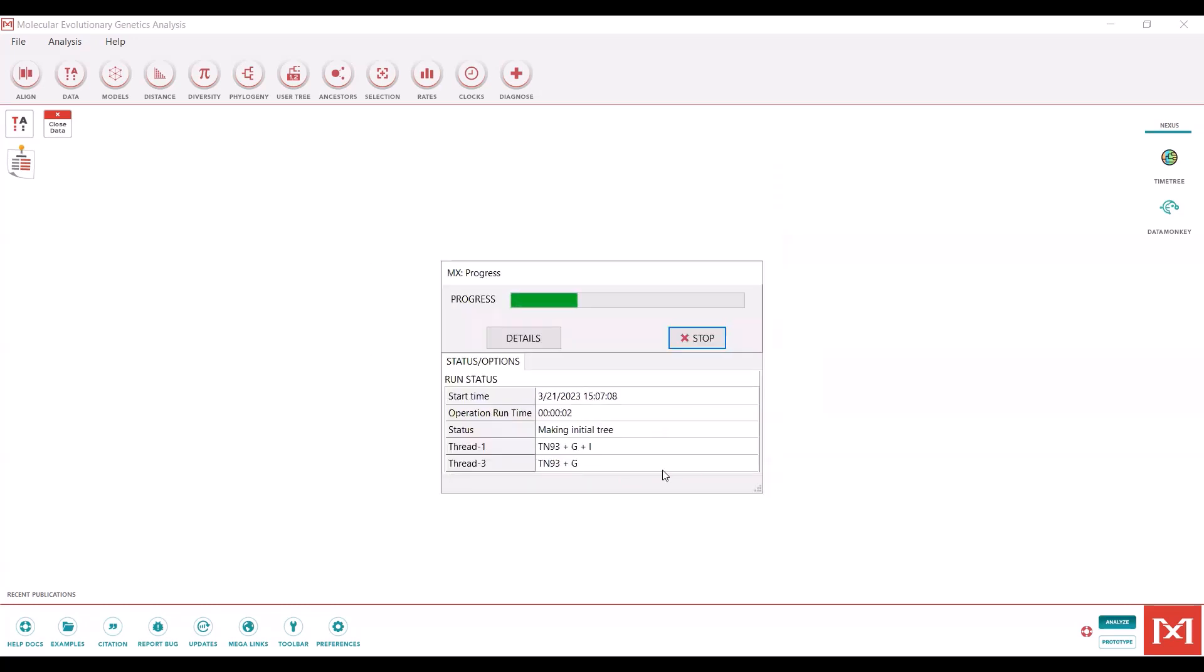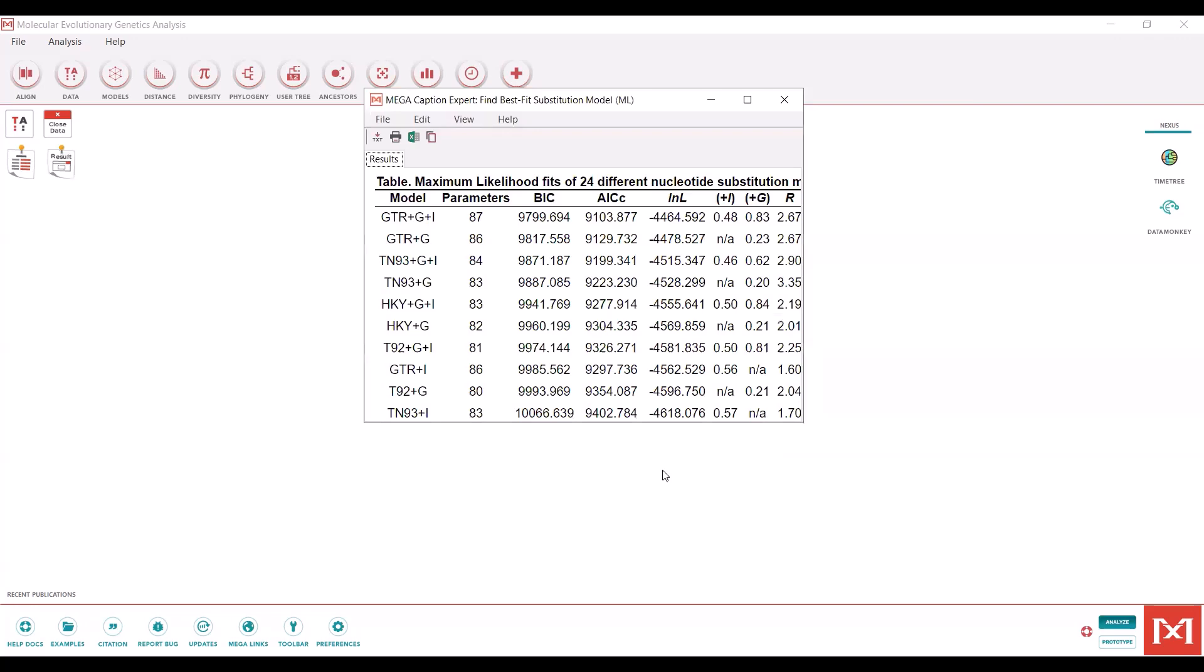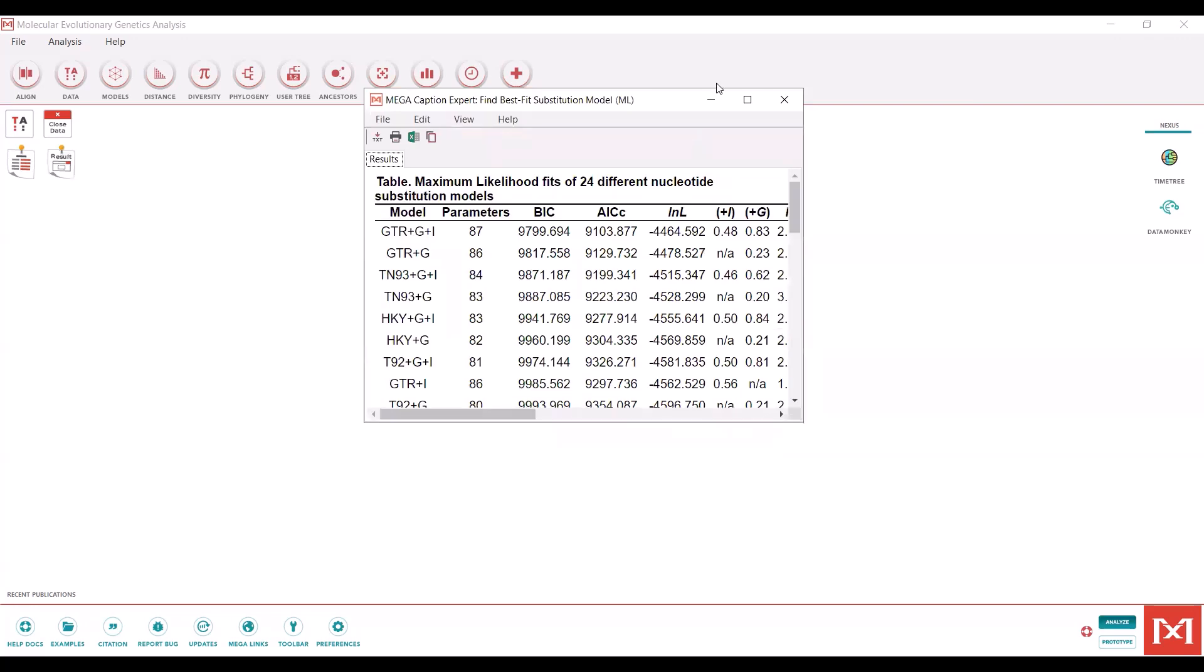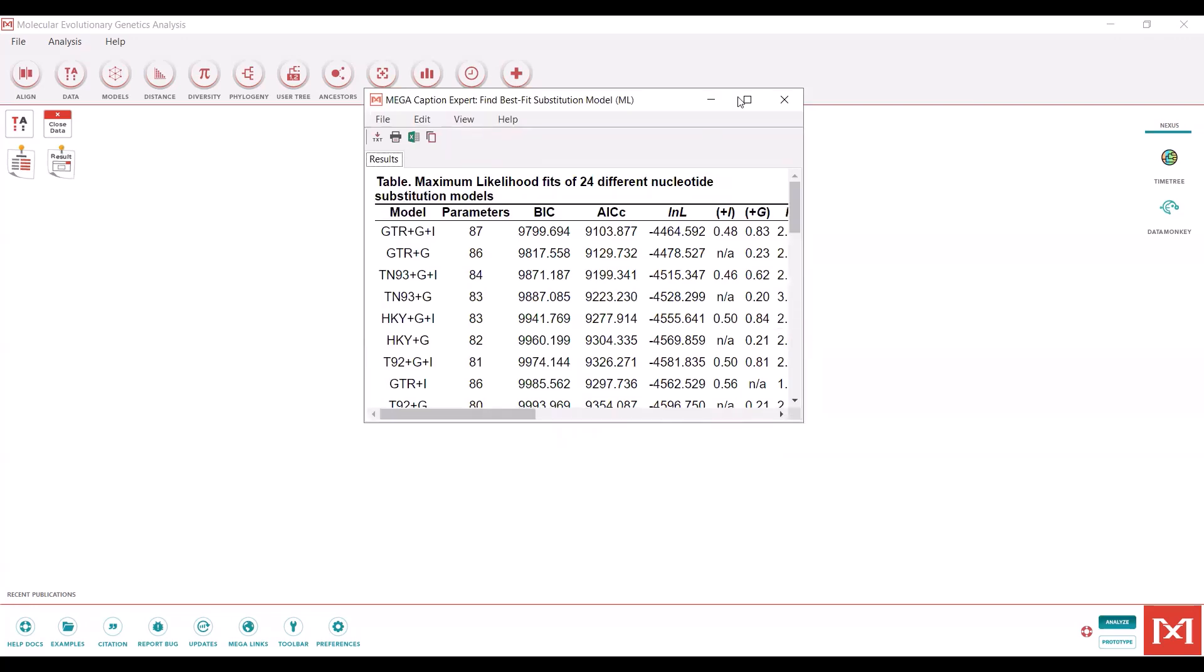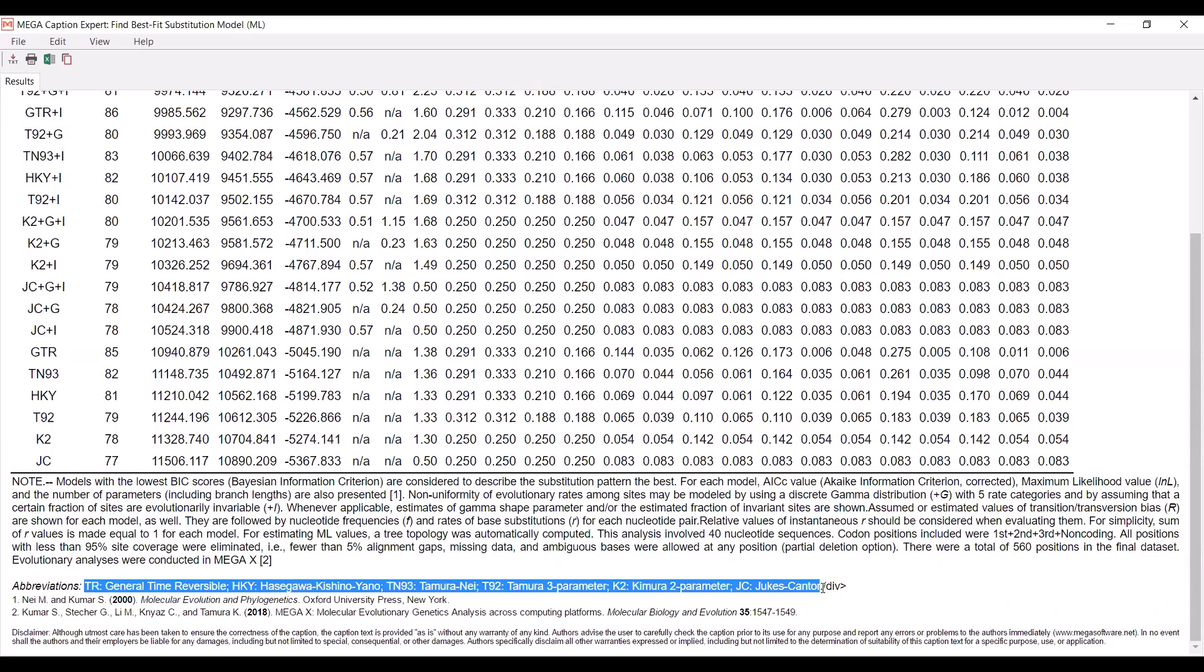This is going to run through all of the nucleotide substitution models that are pre-programmed within MEGA, which are all fairly standard use. The output will be this table. You can see it will automatically sort what MEGA believes is the most appropriate substitution model to the top. That's going to be a general time reversible model with a gamma distribution and invariant sites. The way I know that is because they give you the definitions of all these abbreviations down here. You don't need to know this from scratch or look somewhere else for it. It's all here.